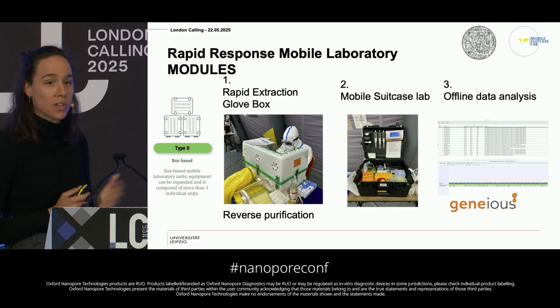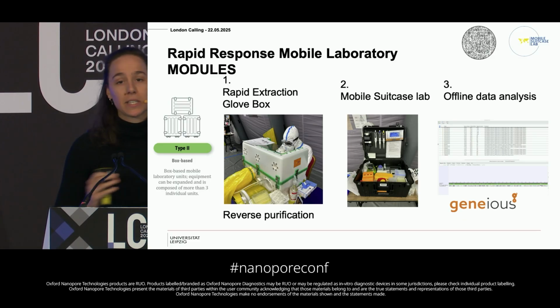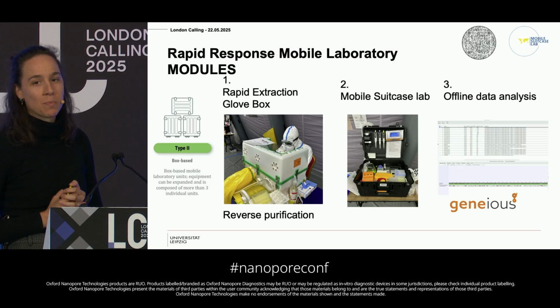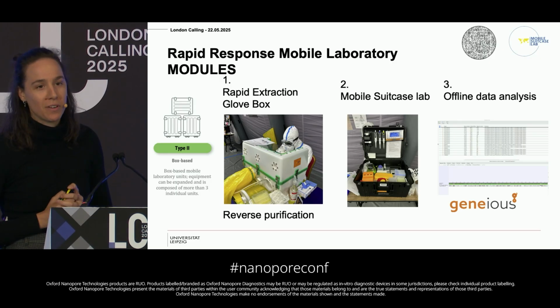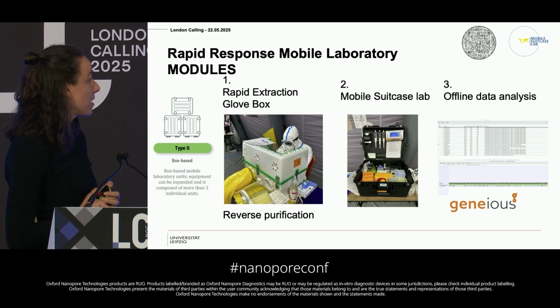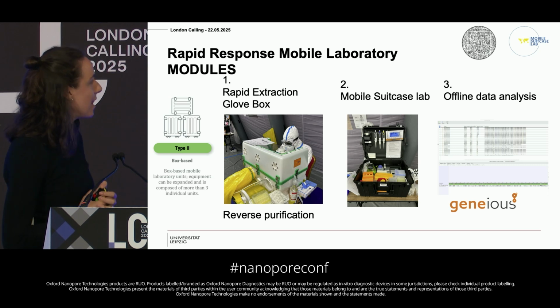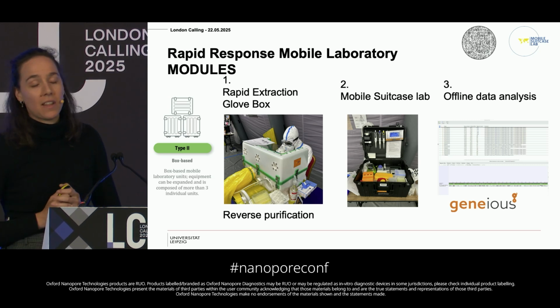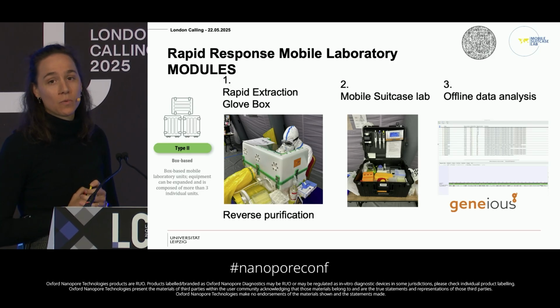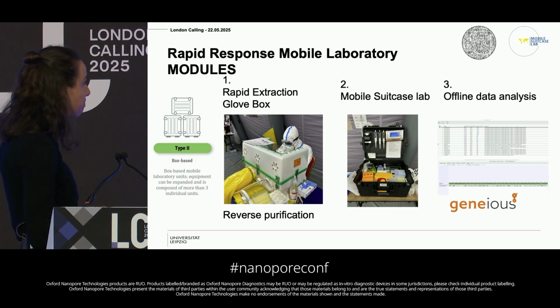And we use, of course, also Nanopore Technologies. Here you can see the MK1C. We've used MK1B as well, and now we're also switching to MK1D. So this is quite unique to Nanopore, that we have those small devices that fit in the backpack when you're traveling. Yeah, it's something that we use very eagerly. And then, of course, the data analysis part, which is a tricky one as well. We try to use softwares that are user-friendly as possible, and a feature that's also important to us would be the offline methodology. It's because you don't always have the stable internet connection.